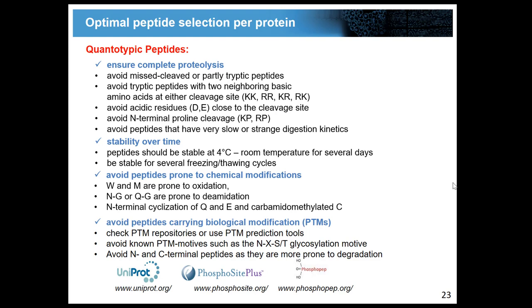My personal approach, and what makes me feel not too bad about relaxing on those criteria, is that some of them, especially these first three, can be not so problematic when your aim is relative quantification, if you can make sure that whatever happens in these cases happens to the same extent in all the samples you would like to compare.